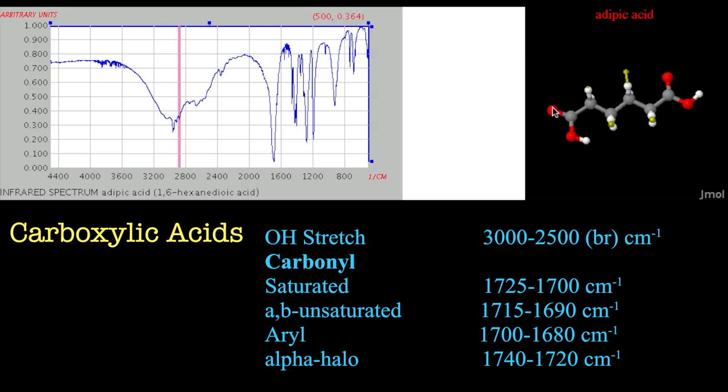Okay, so we've got the CHs. We've got the hydrogen bonding and the last thing to do is have a look at this fella here. This is about 1683. There we are. I'm guessing that's probably the carboxylate or the carbonyl proton. Not the carbonyl proton. I've lost my mind. That's a carbonyl functional group.